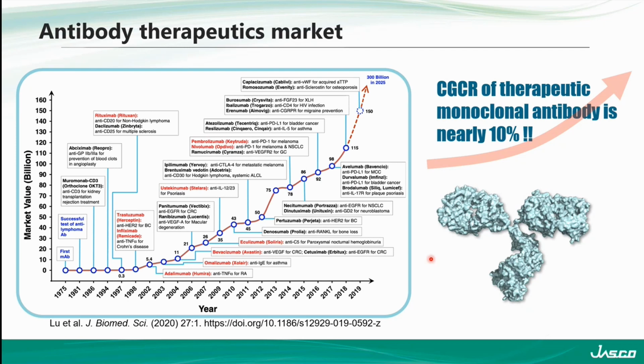And with the first development of mAb materials, they became prime candidates for very specific drugs with very specific types of targets, right? So antibodies in the body are already doing that sort of work, and so why not utilize those properties for drug development as well?